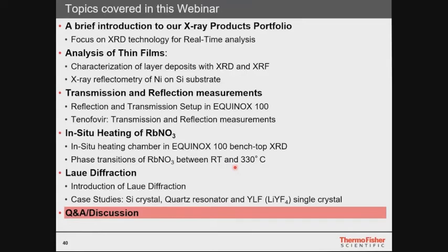Yes, it does. There is a function which affects the signal to noise ratio. If you want to double your signal to noise ratio, you have to increase the measurement time by 4. So there is a square in it. Signal to noise ratio is just you get your noise band, which is maybe something like 100 counts, and you have a signal of maybe 1000 counts.